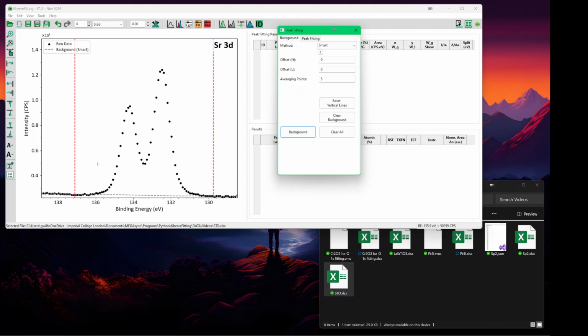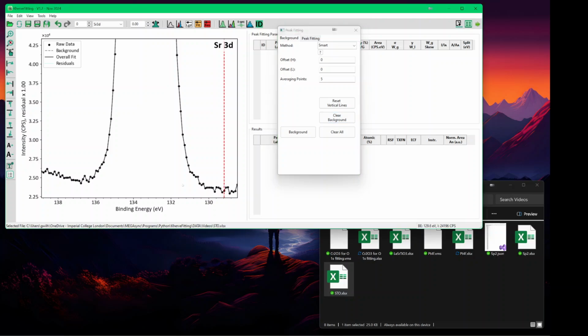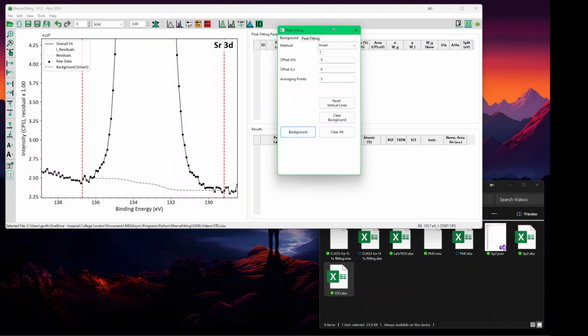So now I'm going to use Control down to zoom into the thing. That was done correctly. But I may have wanted to go up to here, and maybe up to there. So let's just restart to show what we can do. Clear background. So I'm going to go up to there. Maybe let's try there, and let's see if it does it. And you see it doesn't.